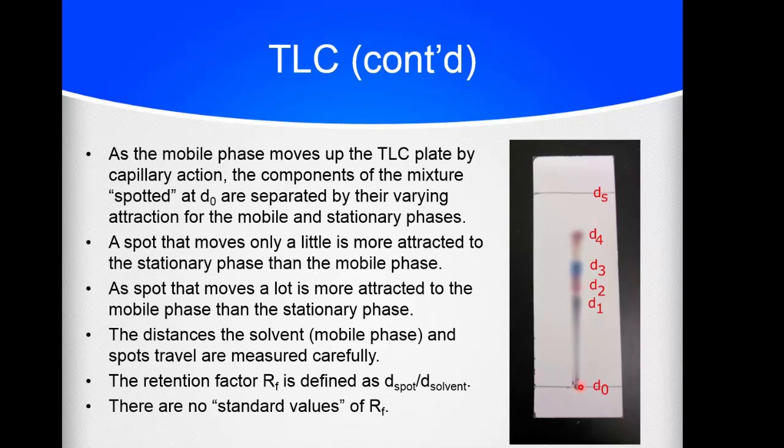You spot your sample near the bottom, not all the way at the bottom, for reasons that we'll discuss on the next slide, but it would just dissolve into the mobile phase rather than get carried up the plate. And this will be resting in a little vat of mobile phase, so below this line that you've drawn on there, that's as far up as the mobile phase could come in the vat.